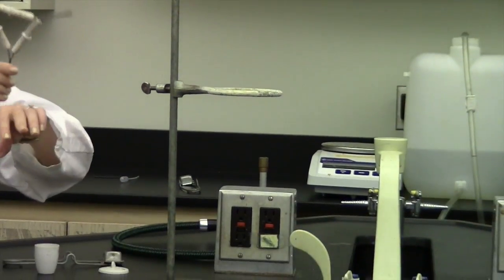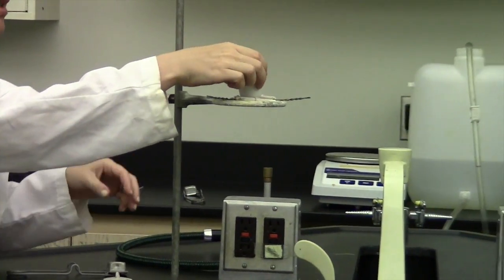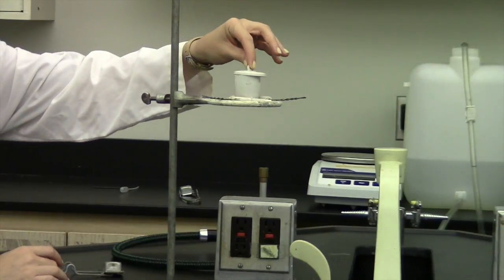The clay triangle will just sit right over the ring. Your crucible fits nicely right within the ring and then if you needed the lid you would use it.